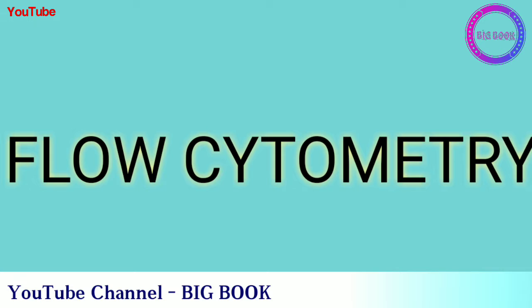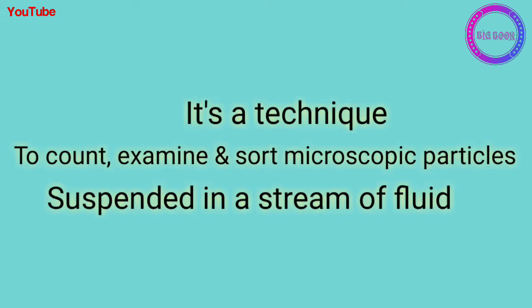Today we are going to discuss flow cytometry. It's a technique to count, examine and sort microscopic particles suspended in a stream of fluid.